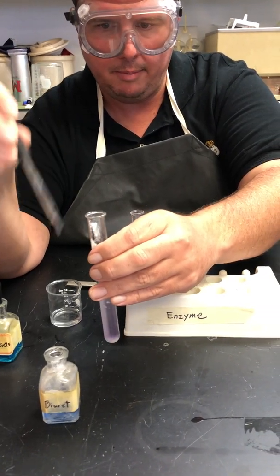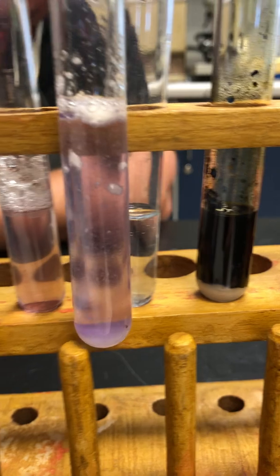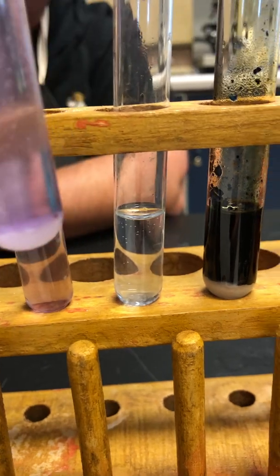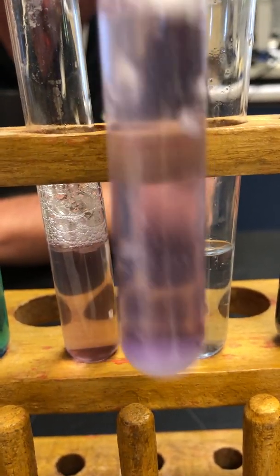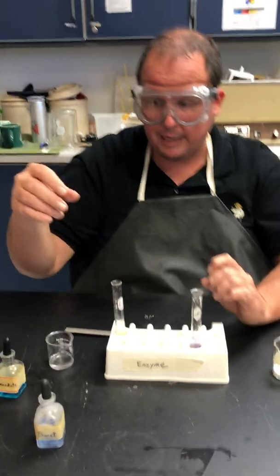I'm going to let them make up their own mind. Put it next to the control and the test. Which one does that one look most like? Oh, that's beautiful. I'm not going to tell you. If you watch the demo, then you know what's in there and what isn't. All right, I'm going to put this one back, and I will show you again at the end.